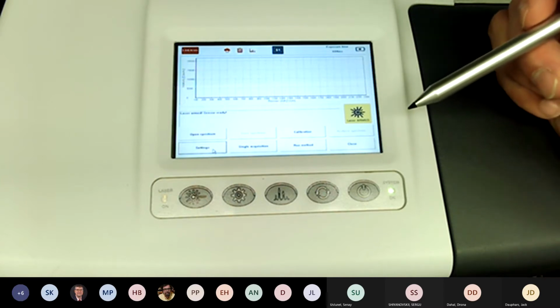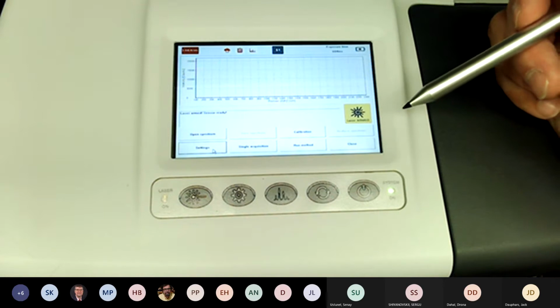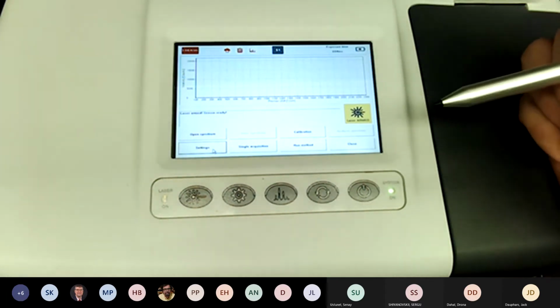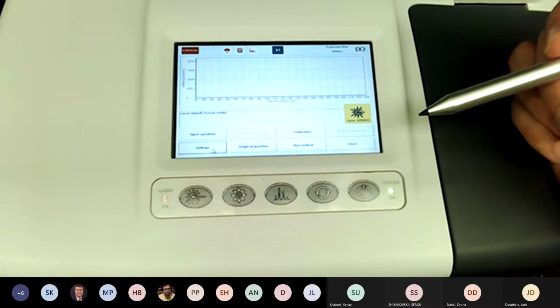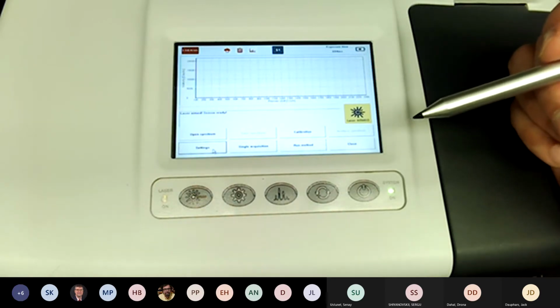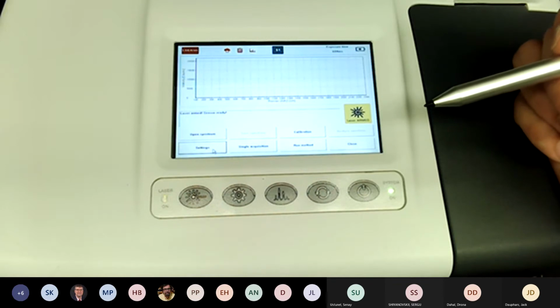This does have a thumb drive that you can plug right into the instrument, transfer your samples to it, take them back to your computer, and do as you need, or you can put them directly on a network if you need to. Go from there.